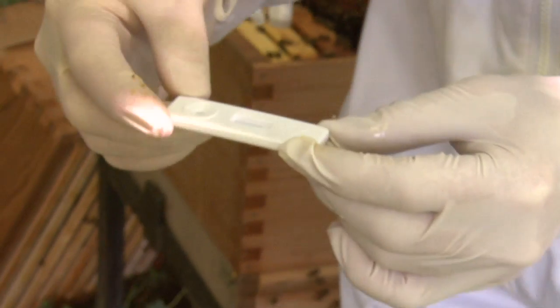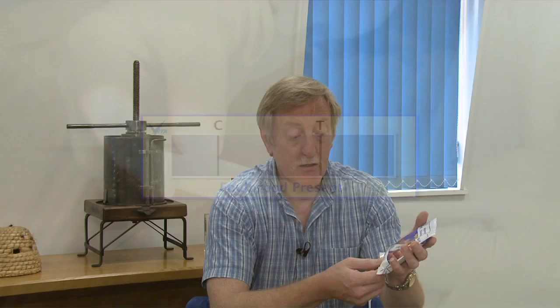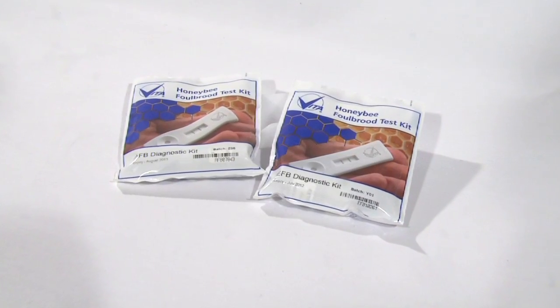After about three minutes, if only the control line shows, then the result is negative. If the test line also shows, then Foulbrood is present. You can tell if a colony has disease within three minutes by using these kits.